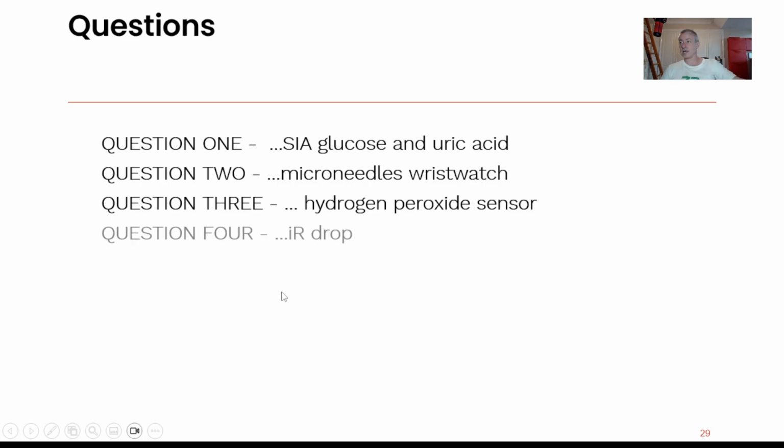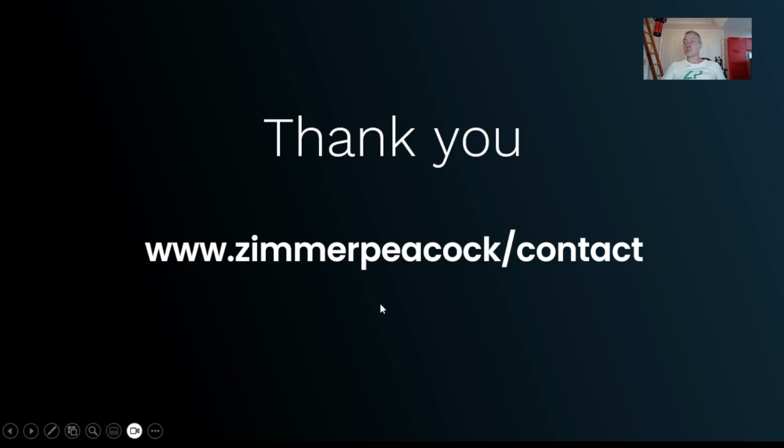And then I think people think that they're having an IR drop problem with their homemade screen printed electrodes or with their electrodes that they've sourced from a third party, but it's actually the conductive tracks of the ink that are used to make the electrodes that is the problem.